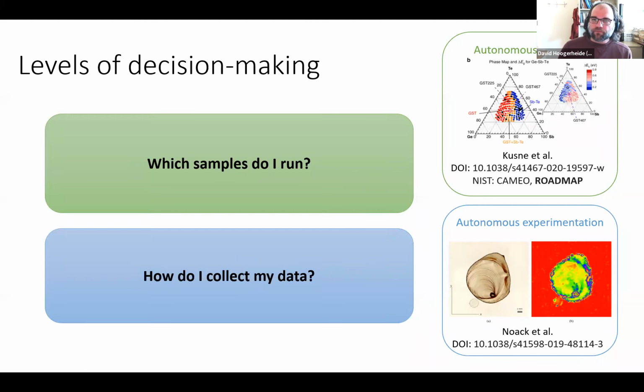So what we're going to do in this, reflectivity, of course, is a one-dimensional technique. So we're actually going to reduce the dimensionality of the problem and go down to 1 dimension, and we'll focus a lot on collecting data.